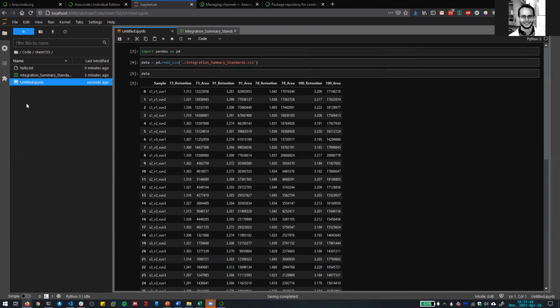If you're at the point already where you've got a Jupyter notebook running and you've made a folder for Chem153, then you can go to this URL. Let me make sure I can still see chat and participants. Thumbs up real quick: who knows what GitHub is, or at least has heard of it? I'm not expecting many of you to have. A couple people. So GitHub is basically a website that allows you to upload code and share it with other people and work on it together.